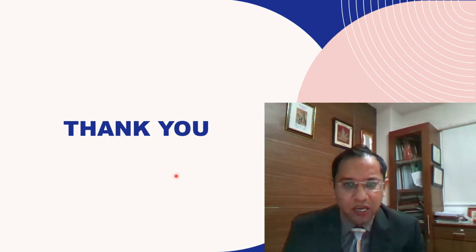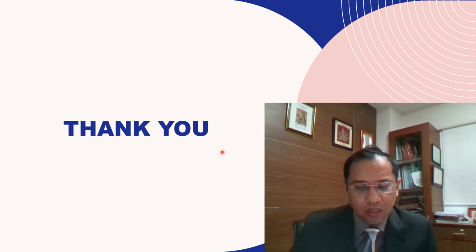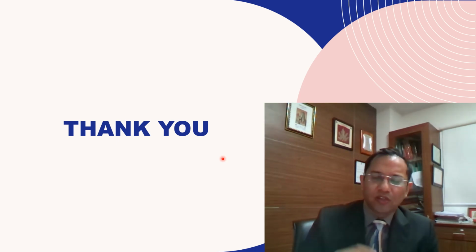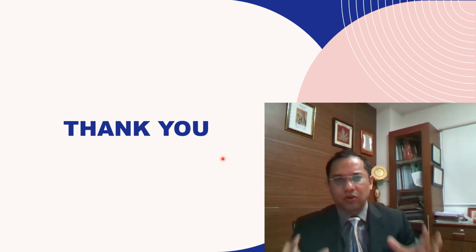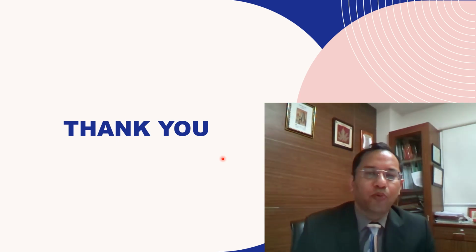So this is how you can calculate with a Nageotte chamber, and I hope we are now able to perform the calculations for both the improved Neubauer chamber and the Nageotte chamber. Improved Neubauer chamber, we all know why it's called improved Neubauer chamber. It's because of the grid that is different from the previous Neubauer chamber, in which the central square had only 16 squares. Now it is 25. That is the only difference between the Neubauer chamber and the improved Neubauer chamber. So this can also be a Viva question. What is the difference between Neubauer and improved Neubauer chamber?